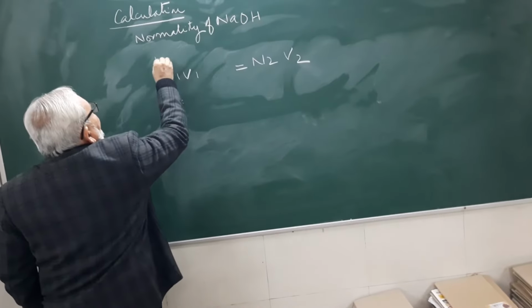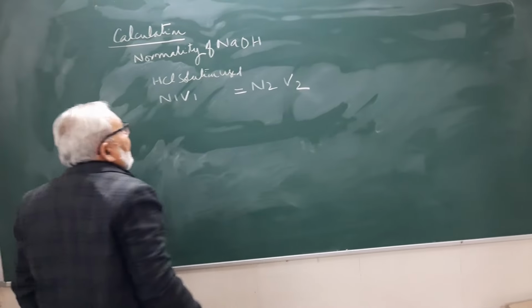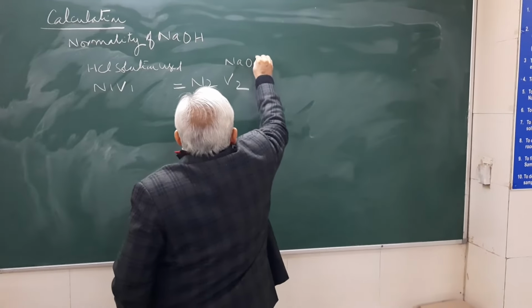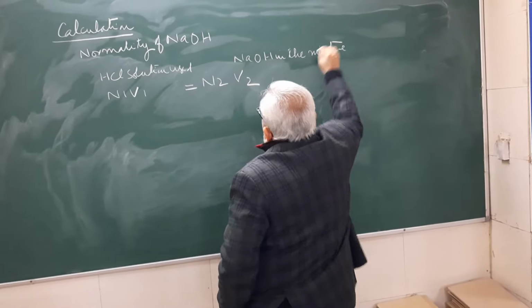This we consider for the HCl solution used, and this we consider for NaOH in the mixture.